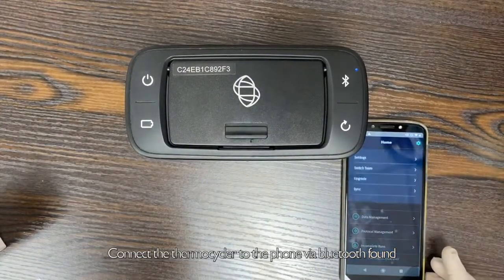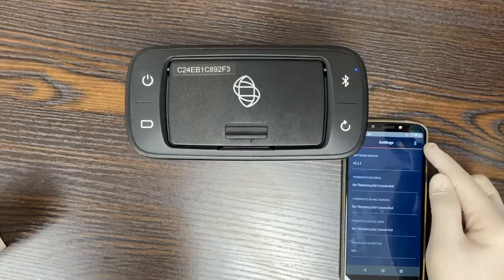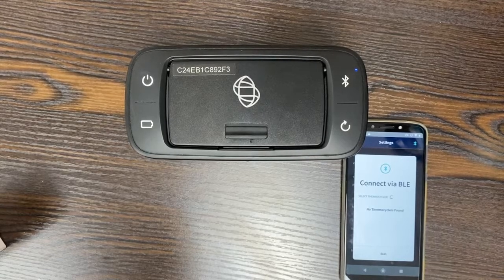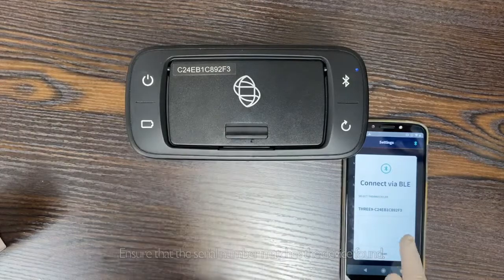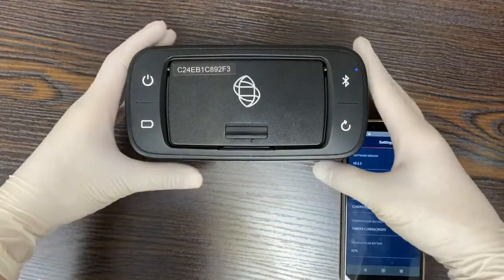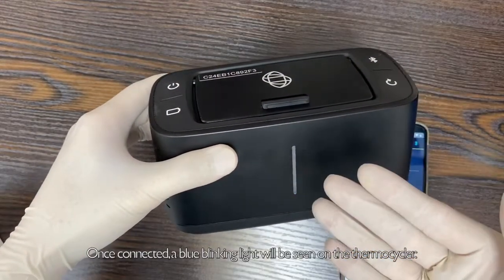Connect the Thermocycler to the phone via Bluetooth found in the App Settings page. Ensure that the serial number matches the device found. Once connected, a blue blinking light will be seen on the Thermocycler.